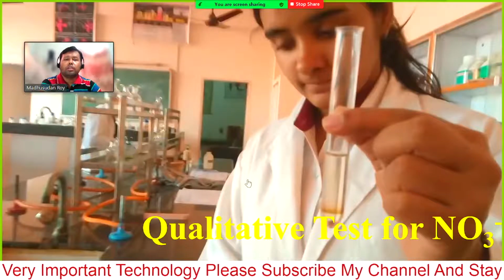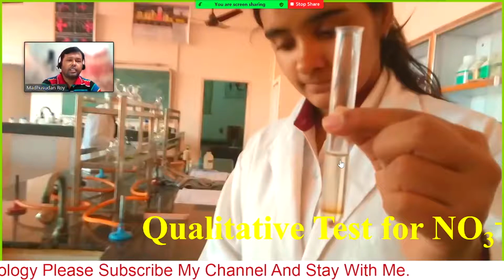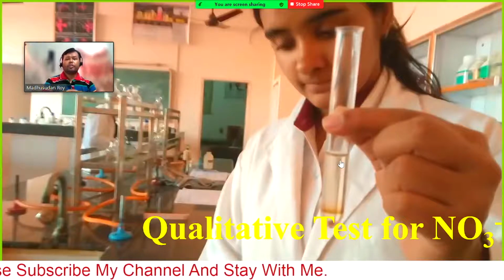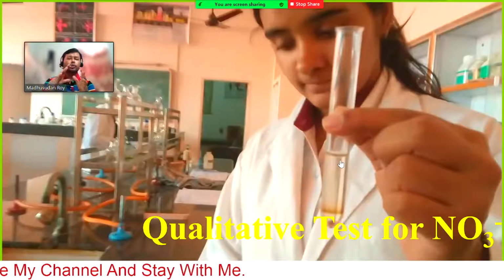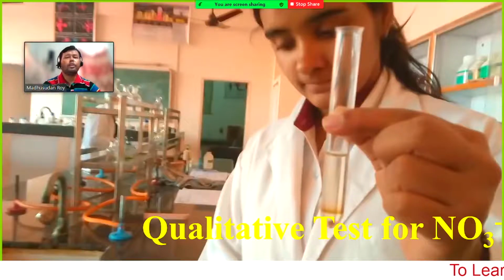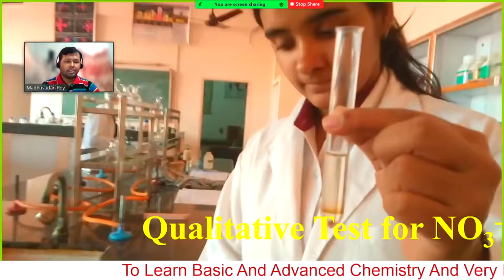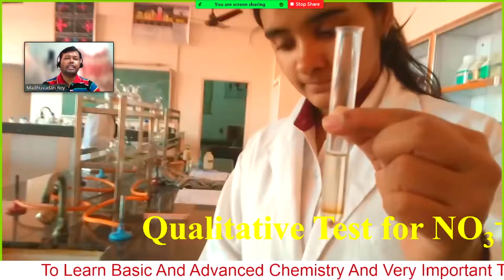So you should be careful while adding sulfuric acid. It should be added slowly and through the side of the test tube, so that it does not mix, and also do not shake the test tube. If you shake the test tube, the ring will dissolve, so you will not observe the ring. So this is the precaution for making the ring for the nitrate test.